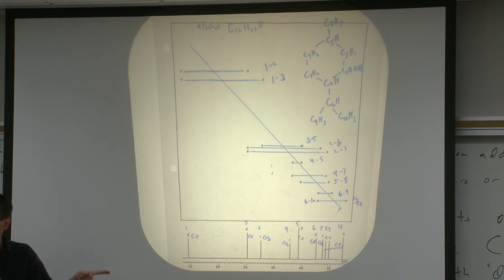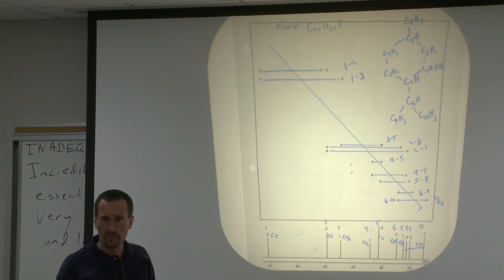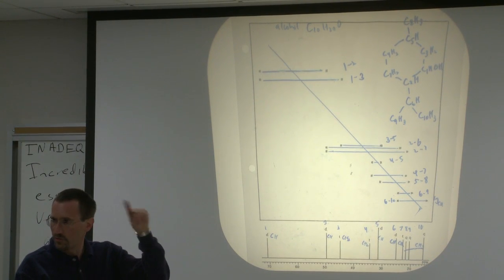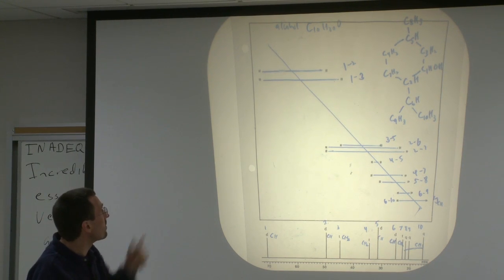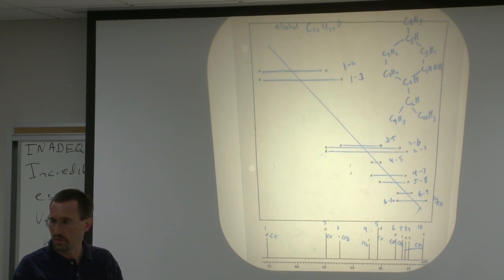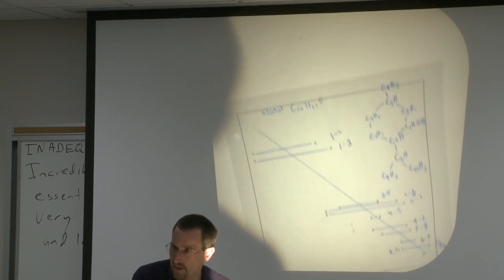Now, we still don't have issues of stereochemistry answered at this point. So we have 3 stereocenters in the molecule, and so if you were trying to figure out what the structure was at this point, of course, you can't get the absolute stereochemistry, so you have to get the stereochemistry of 2 relative to the remaining third one, and that would be from things like coupling constants and NOEs. In fact, this is a cyclohexane ring, so it fits in very well to all the models and issues we've dealt with cyclohexane rings. Anyway, that's largely what there is to the experiment.